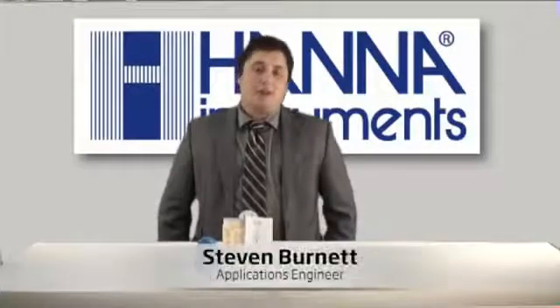Hi, my name is Steven Burnett. I'm an applications engineer for Hanna Instruments. Today we're going to be going over the HI701 Handheld Colorimeter. The 701 is our Free Chlorine Handheld Colorimeter, and it's part of our Checker series, which are designed to be low-cost, high-reliability instruments.